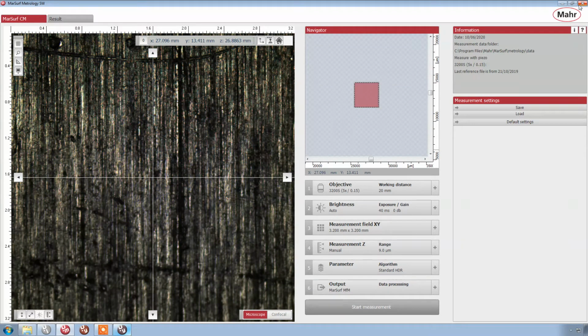There's a number of things happening on the interface for the acquisition software here. We obviously don't have the time to do a full training of this software, so I'm not going to explain to you what every single icon means. But as I use portions of the software, I will tell you what I'm doing.